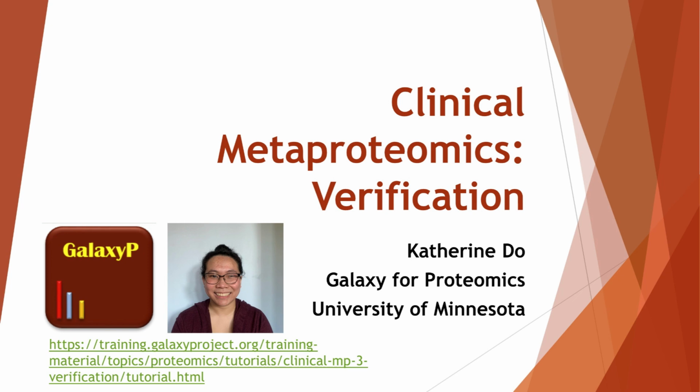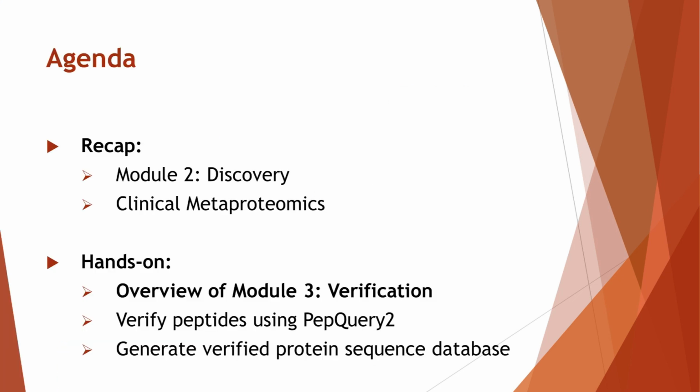Our previous videos covered the background of the clinical metaproteomics field, as well as the first two modules, database generation and discovery. If you haven't already, please watch these videos to gain a better understanding in preparation for this video. So, let's begin. This video will follow a similar agenda as in our previous videos.